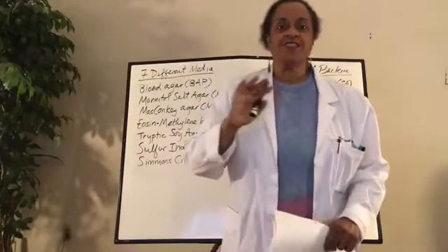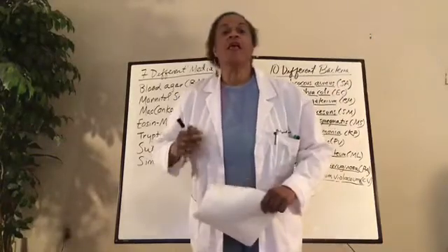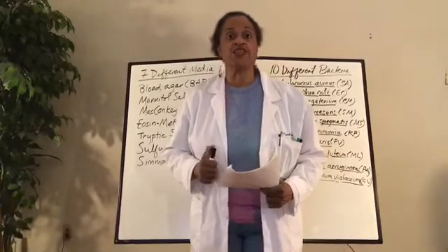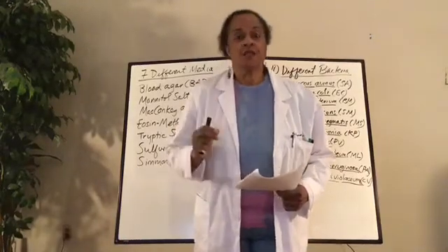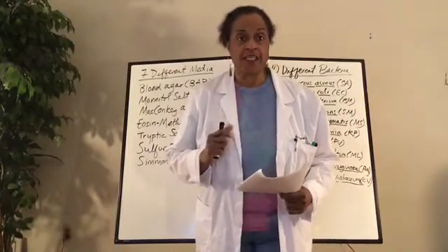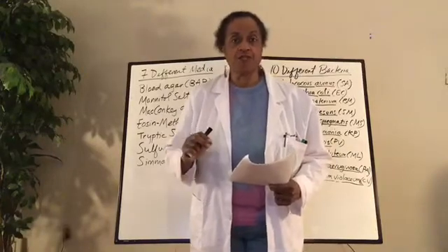Okay, you guys, this is our Zoom office hour, and I'm just doing a video so we could go over differential plates. That's exercise 18 in the lab book. But in the textbook, what will really help is looking at chapter 3 in the textbook. So this is exercise 18 in the differential plates.